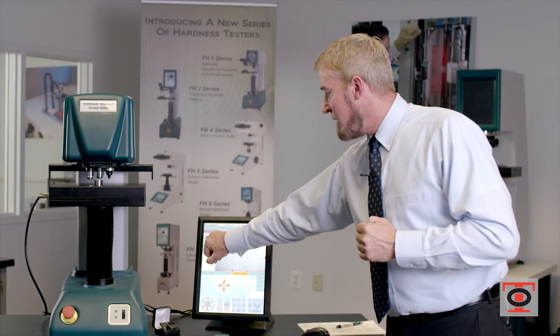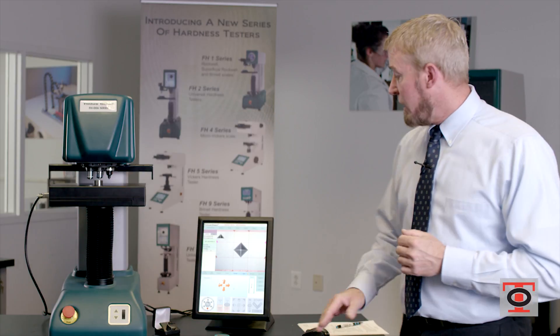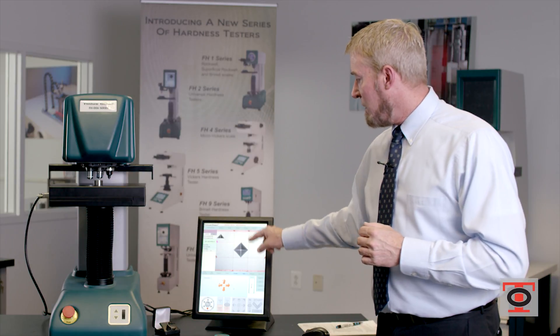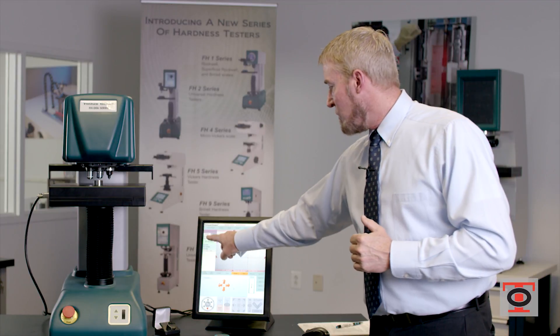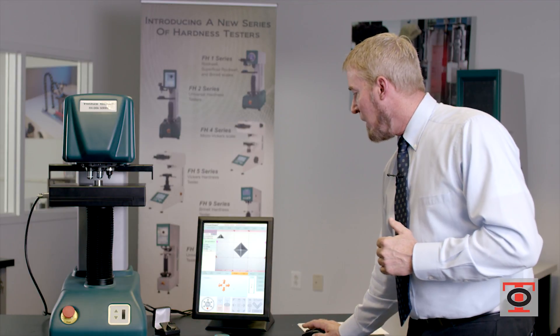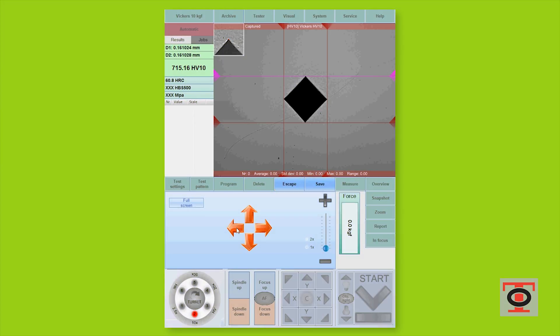So now you'll notice my D1 and D2 are up here. When I get my measurement, my D1 is my east-west measurement and my D2 is my north-south measurement. So now if you see the change in my measurement — when I move one click to the left, I've centered my red dot exactly at the spot where the apex of the corner is. That is the more true measurement.